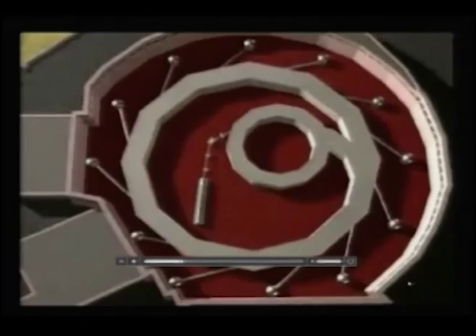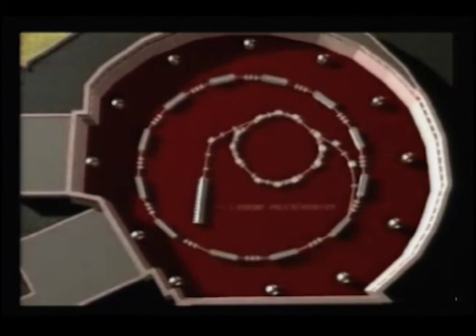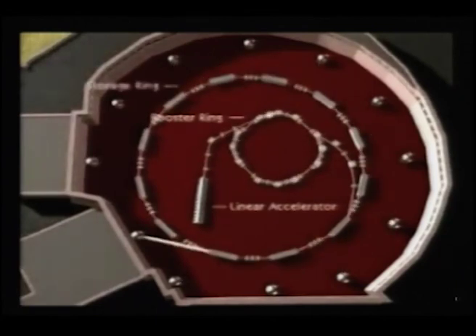We will see a short animation of what this facility will look like, and this is the inner side of the advanced light source, where you can see the inner core generating X-rays from a linear accelerator, which is boosted up by the booster rings, and the booster rings are those which have a magnetic field.